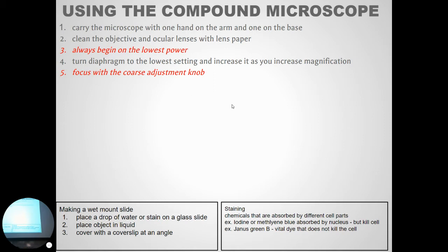When you're using your fingers, you probably remember you move it a tiny amount and it flies off the field of view. With these knobs on the mechanical stage, it's much easier to just move things very carefully. So I like this kind. Problem is they break easy and things like that. So most professional people using microscopes would use something like this with a mechanical stage.